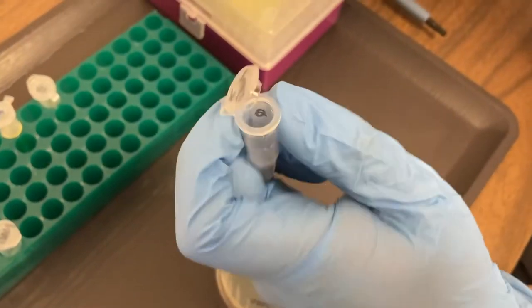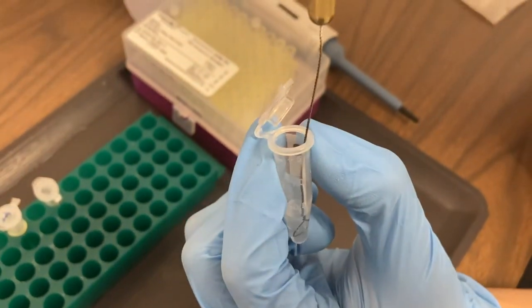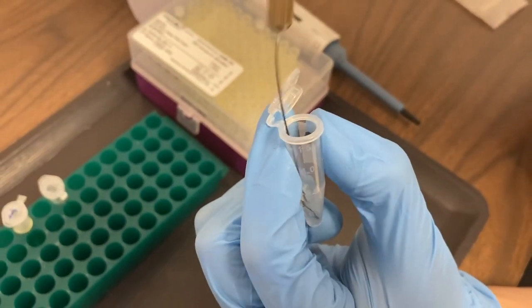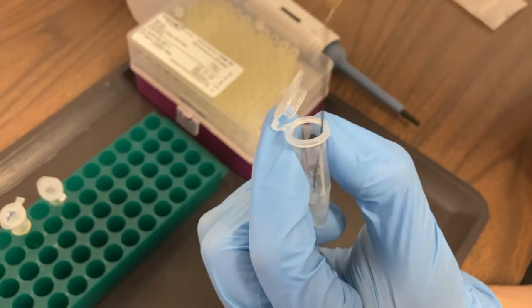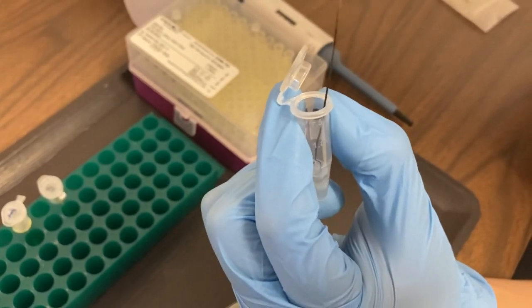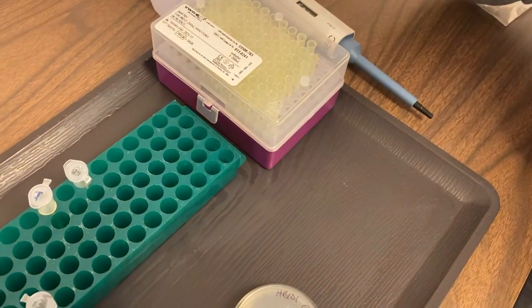We're going to put this in a tube labeled plus DNA. Now inside of this tube is calcium chloride. We're going to stab and twizzle and make sure we get the bacteria off of the loop and into the calcium chloride.